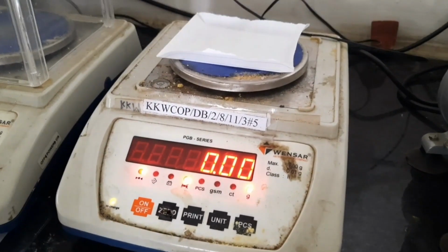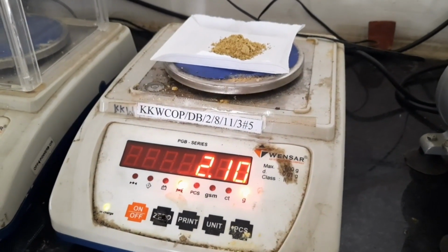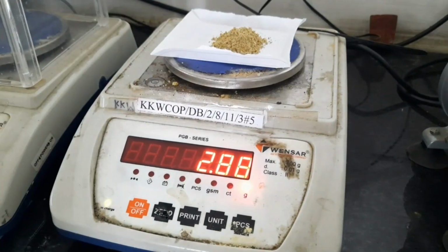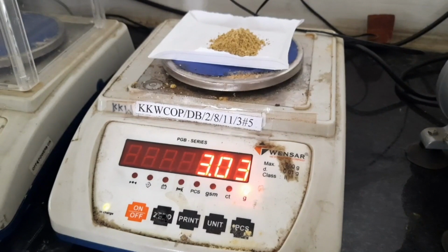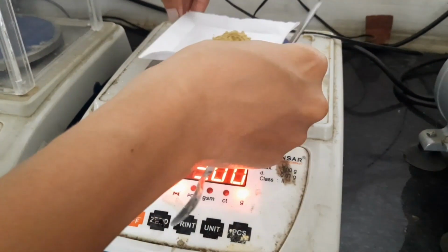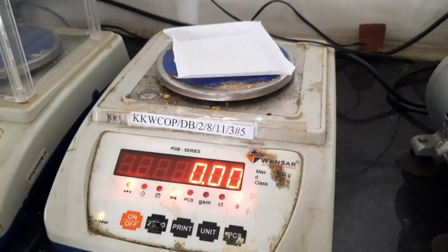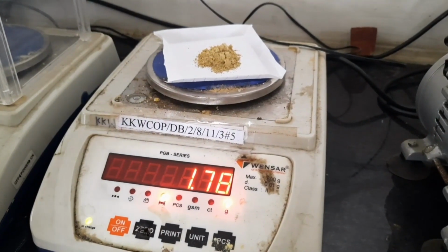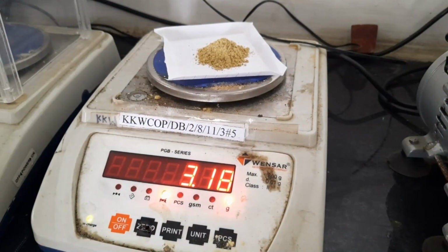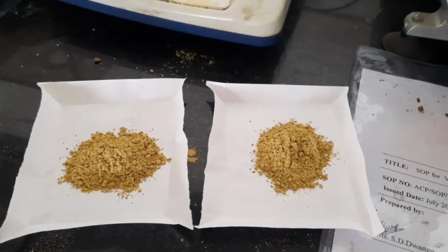For extractive value, we will weigh 3 gram of powder drug for both water soluble and alcohol soluble extractive value. So I have weighed 3 gram of sample.